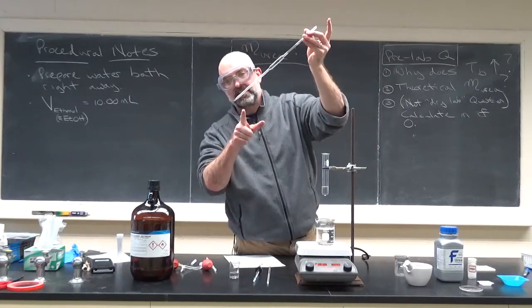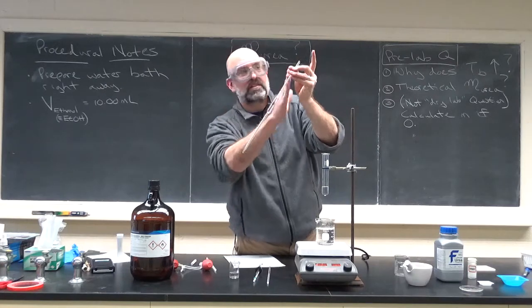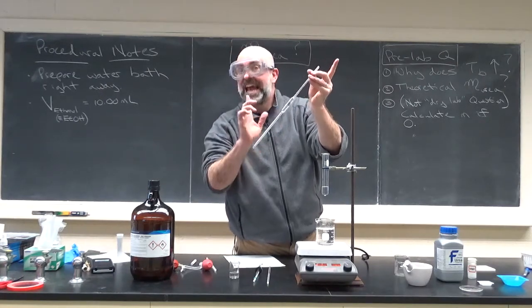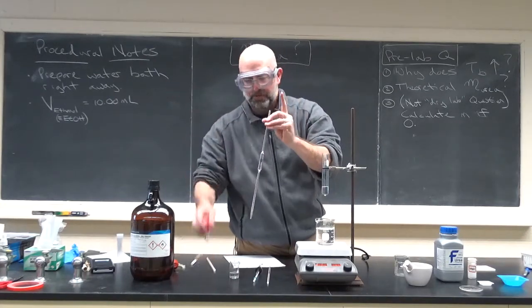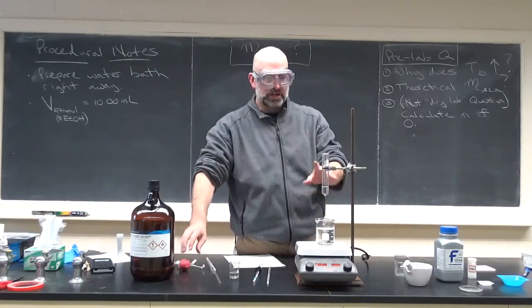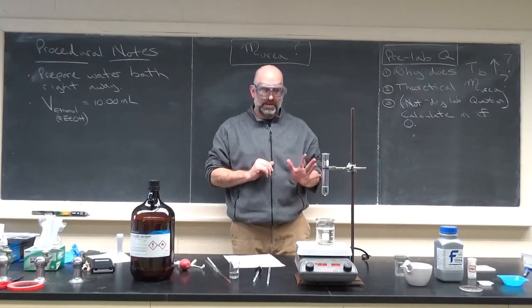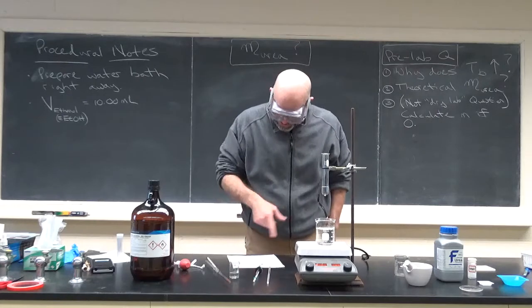And we probably talked about this last semester. You'll notice there's a very little bit of ethanol left here. Leave it in there. This is meant for 10.00 mL to come out the bottom, not to contain. So you don't blow that out with your mouth, which sounds dumb, but you wouldn't take this and expel the remainder. Good. So you've got 10 milliliters of ethanol in there, and it looks like I transferred it pretty well. I don't have any on the side.